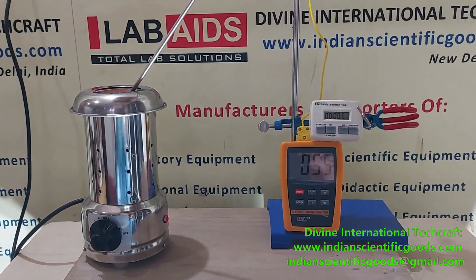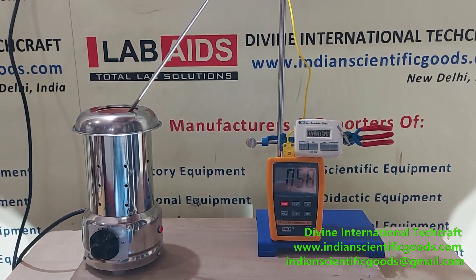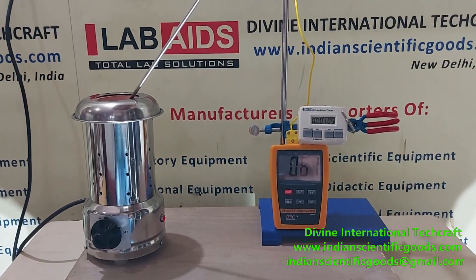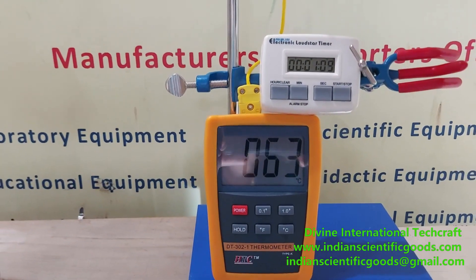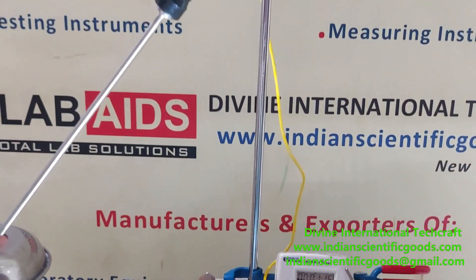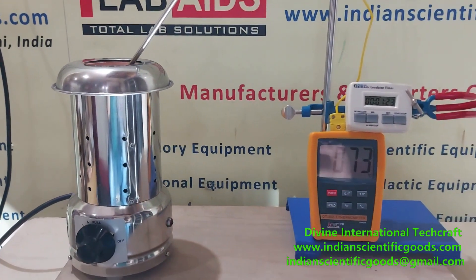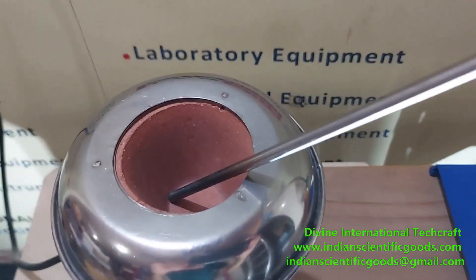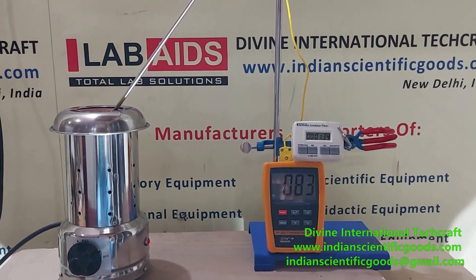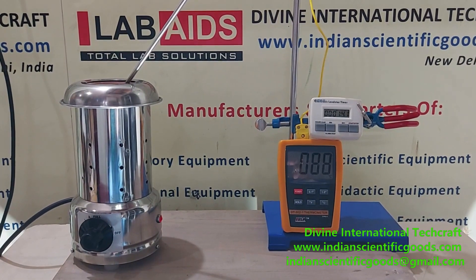These electric Bunsen burners are ideal for places where flames are to be avoided or where there is no gas supply. They can attain a maximum temperature of over 750 degrees centigrade and are ideal for use in fume hoods. We can see that the temperature is increasing. This digital thermometer has a K-type thermocouple and a long stem that has been inserted into the electric Bunsen burner.